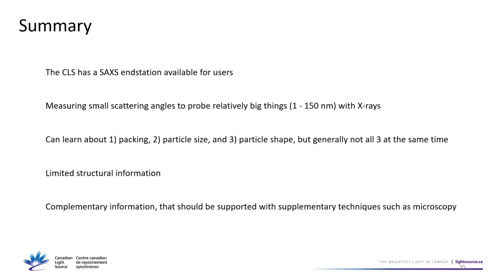If you have a really concentrated solution and your particles start packing together, you're probably not going to be able to see these other things. If you have a really dilute solution, well, you're not going to learn about how they pack because they're too dilute. So it's important to always bring a range of concentrations. I don't know what's going to work on the first try, so bring a few.